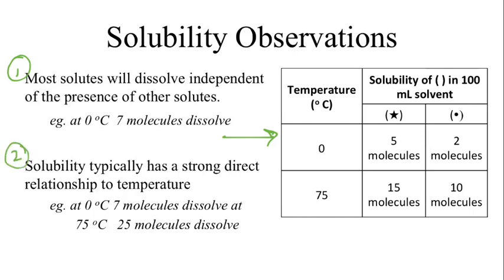accurate statement to make. The next assumption that we're going to make is that solubility has a very strong and direct relationship to temperature. As we increase the temperature, we increase solubility. We already discussed why that might be important.